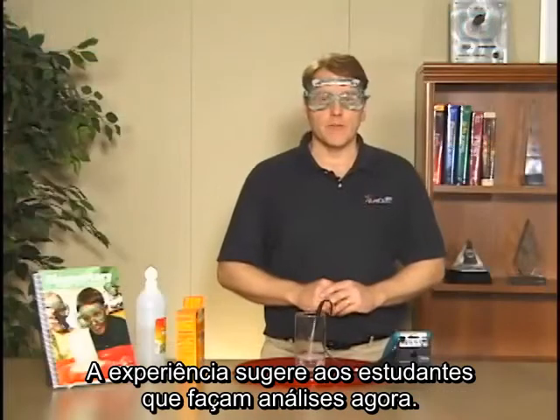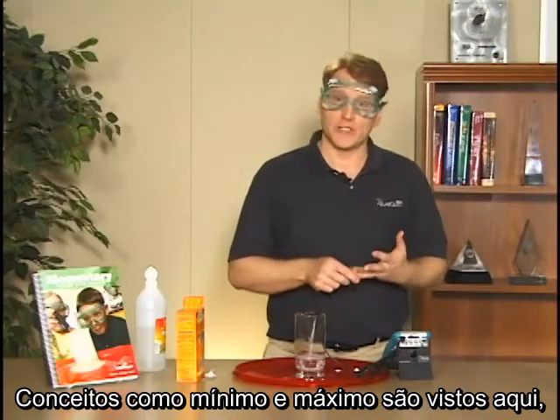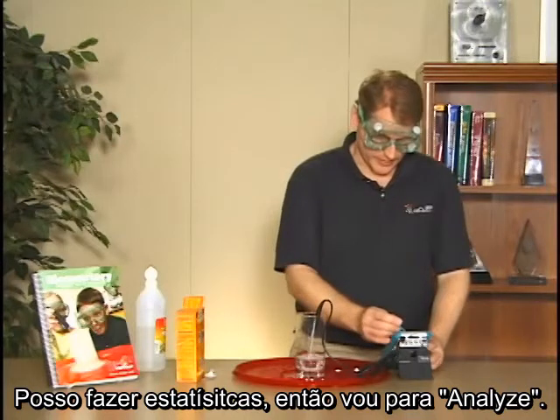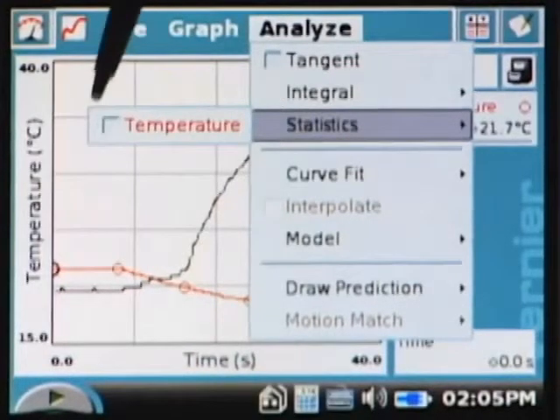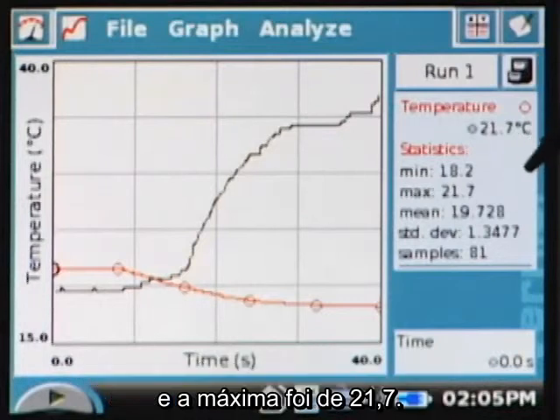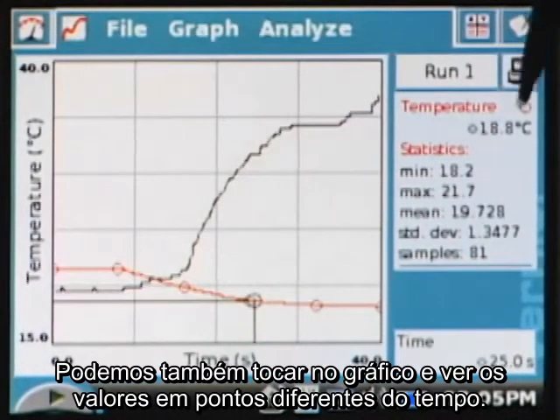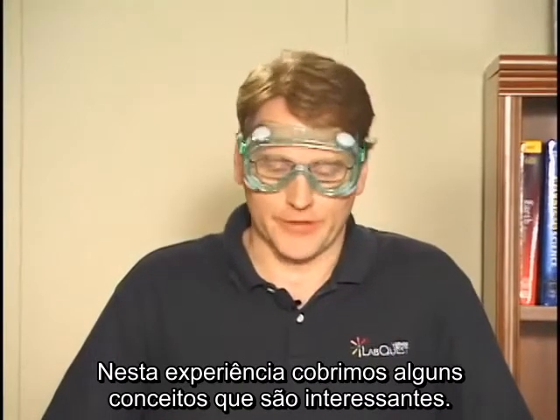What the lab asked the students to do now is to go in and do some analysis. And so concepts like minimum and maximum are covered here. So some mathematical concepts are coming into this. So what I can do is some statistics, and I'm going to go to Analyze, and we go to Statistics. And over on the right side of the screen, we see the minimum temperature was 18.2, the maximum was 21.7, and so we can see that there. And we can even move along our graph and actually find the values at different points in time if we want to.